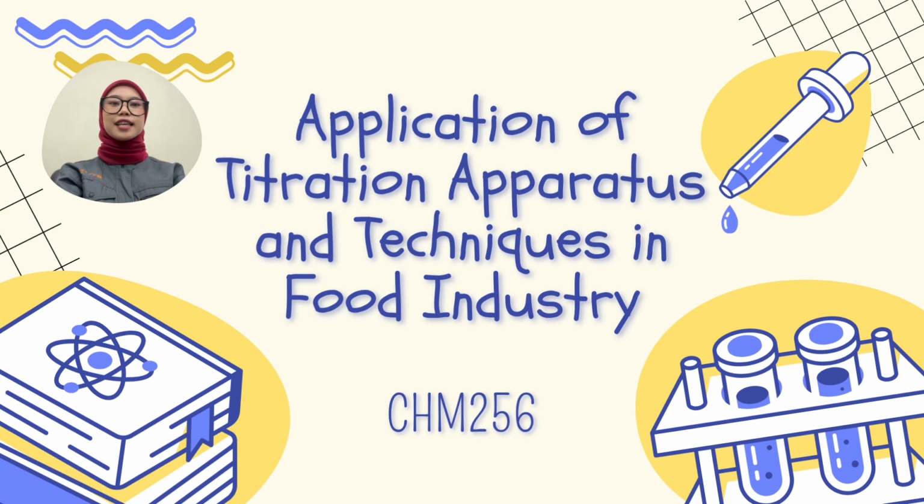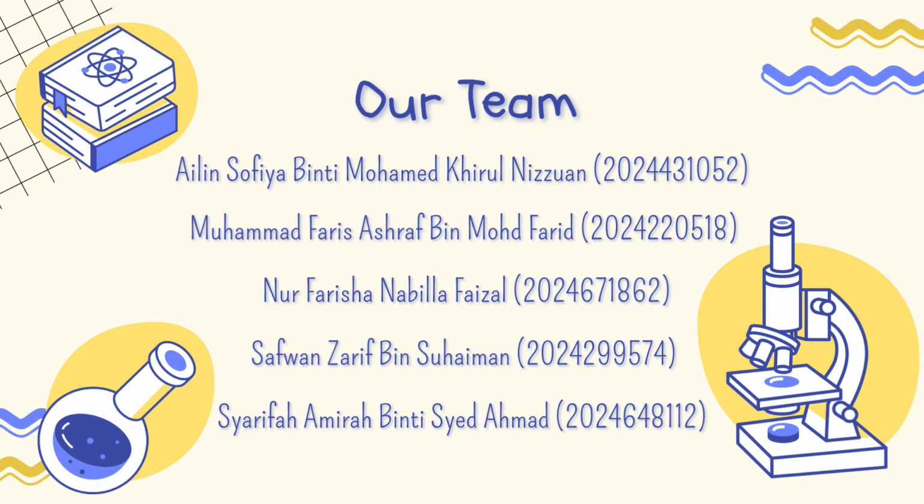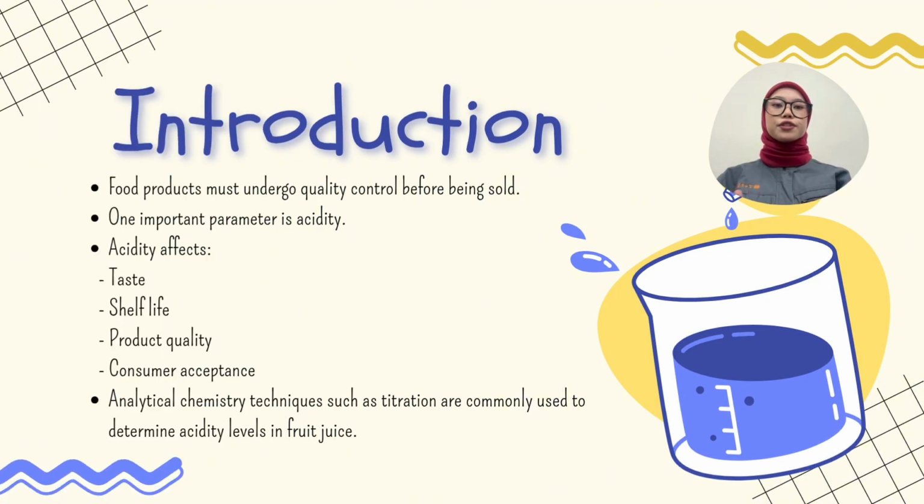Without further ado, let's begin with the introduction. Fruit juice is one of the most popular beverages consumed worldwide. Besides providing nutritional benefits, consumers also expect every bottle of juice to have a pleasant taste and consistent quality. Before any food product is released to the market, it must undergo several quality control tests to ensure that it meets industrial standards and is safe for consumption.